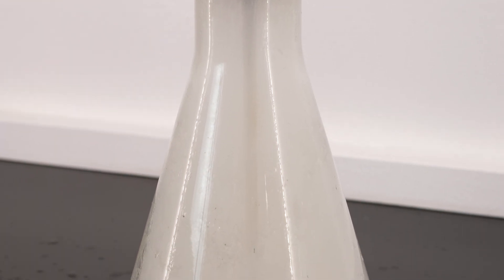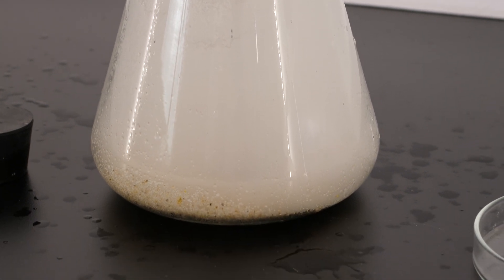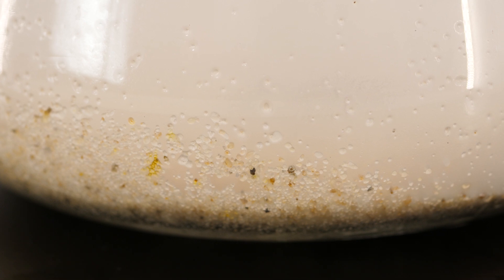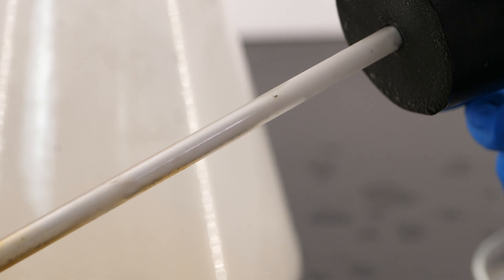Now that the flask has cooled, let's examine the product more closely. As you can see, sodium chloride crystals formed on the inside of the flask and in the glass tube. Through the process of synthesis, sodium and chlorine combined to produce the compound sodium chloride.